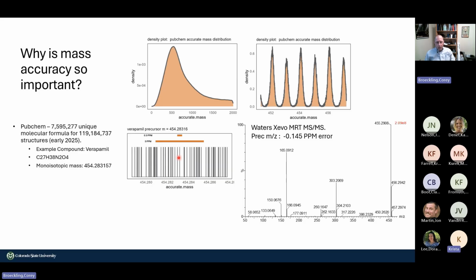And so by increasing the mass resolving power and the mass accuracy, we can be much more confident when assigning a formula to this analyte. We've narrowed it down to 2 using just the MS accurate mass alone. Now let's assume that all the fragment ions are also formulas in the PubChem database, and in this case, that's actually true. You can find formulas representing all of these in PubChem.